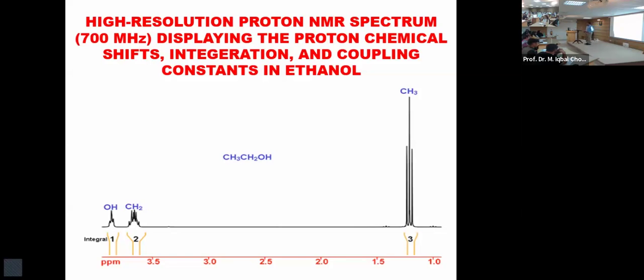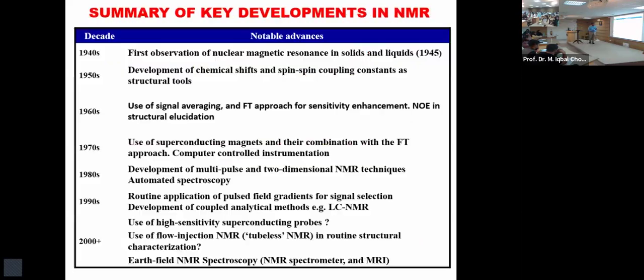I leave a question for you. All of these protons are immersed in the same magnetic field. When this was recorded back in the 1960s, there was an electromagnet, before there was a permanent magnet. All of them have exactly the same magnetic field. Why are they behaving differently? Why do they appear at different places on the NMR spectrum? Okay, one question. You don't need to respond to me, it's not that important.